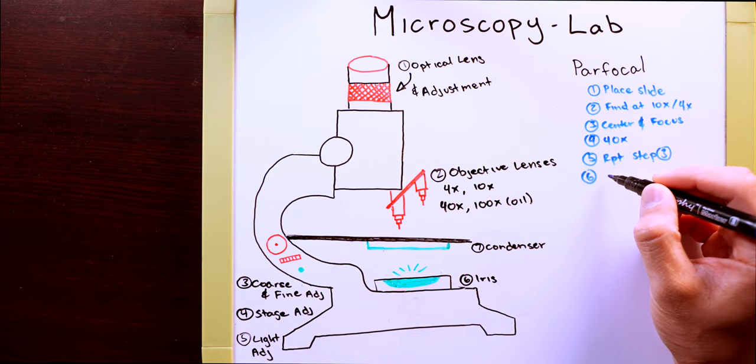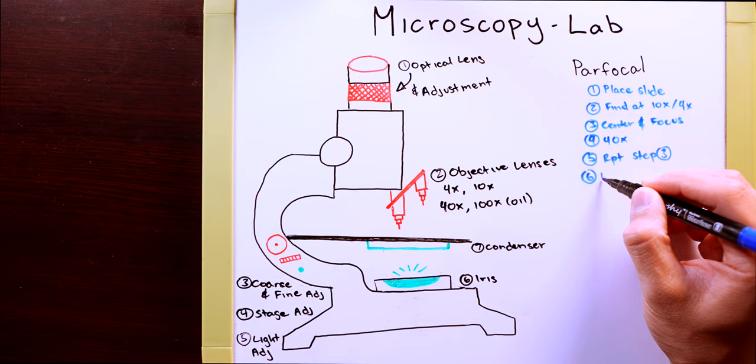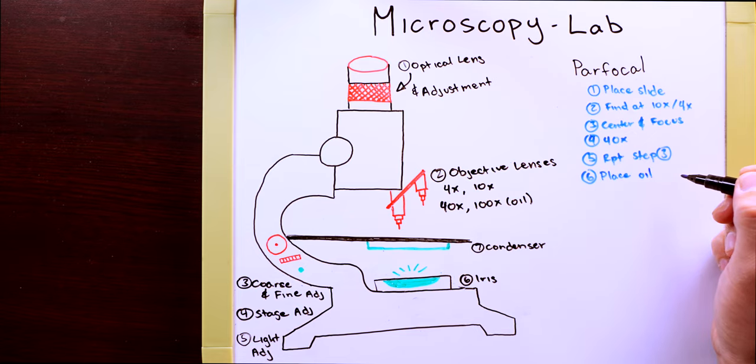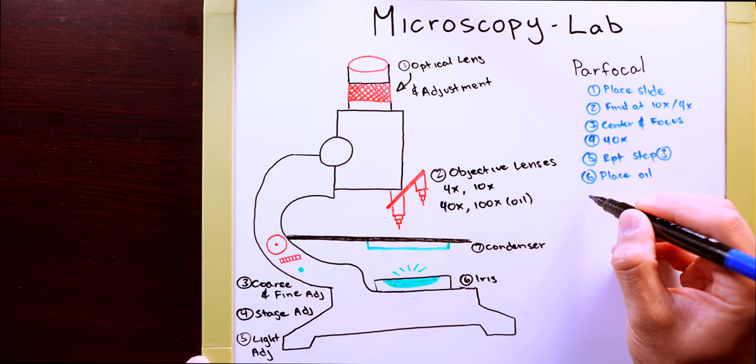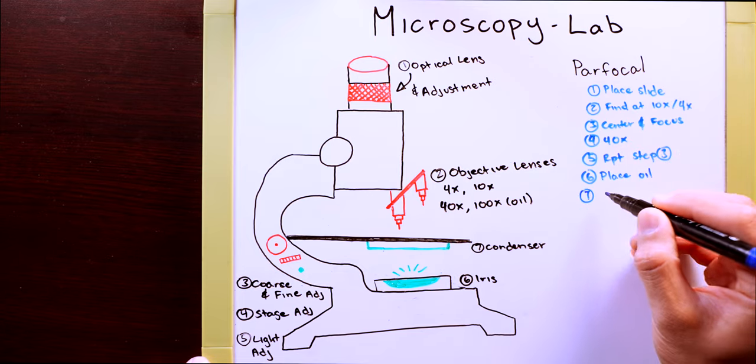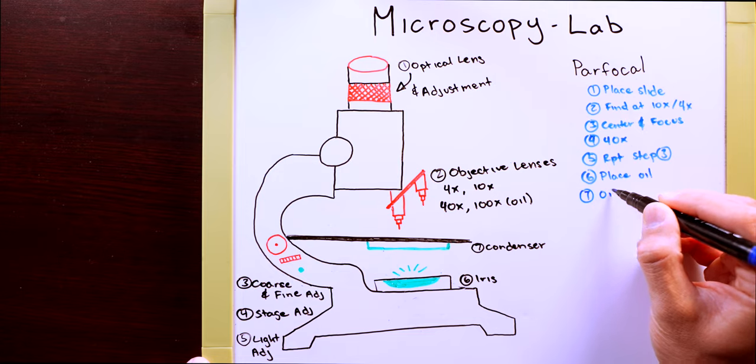That gap is going to allow you to place oil and one drop of oil immersion is just enough and you want to do this on the slide, never on the lens. So one drop of oil immersion in that gap stop between the 40 and 100x and then you will go to oil immersion or your 100x.